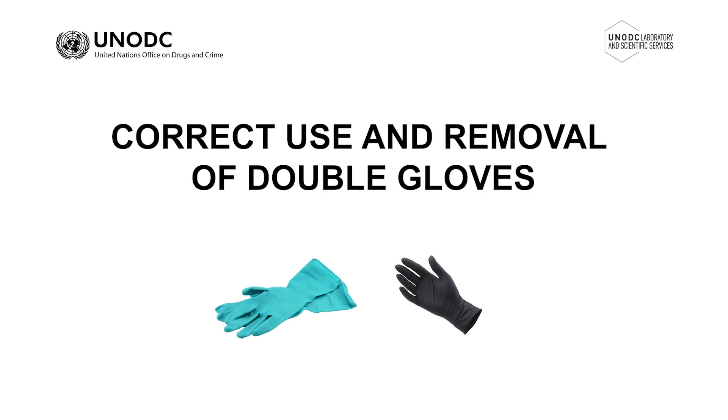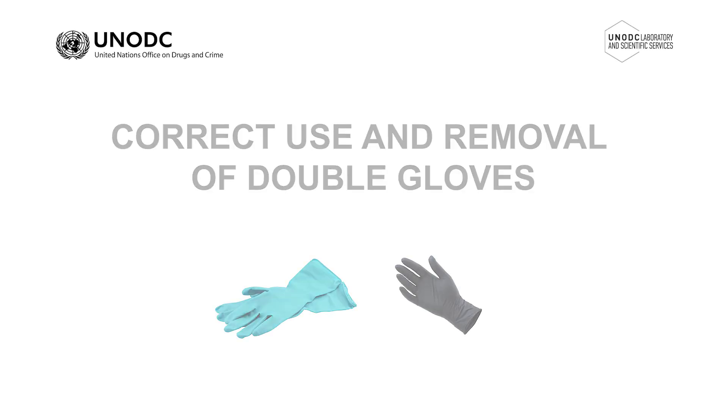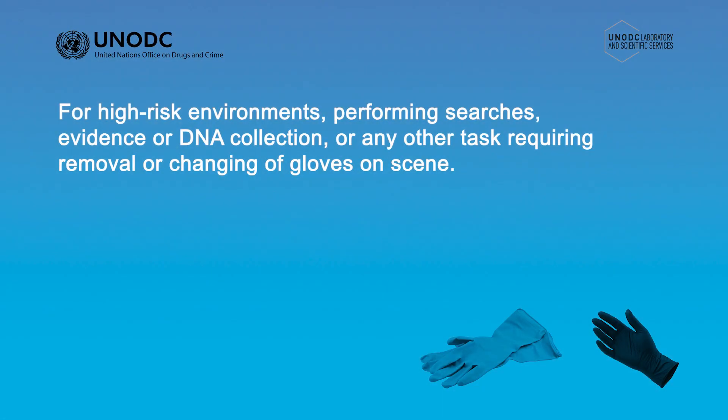Correct use and removal of double gloves. If you're working in a high-risk environment, performing searches, evidence or DNA collection, or undertaking any task where you're required to regularly remove or change your gloves, it may be appropriate to double glove.